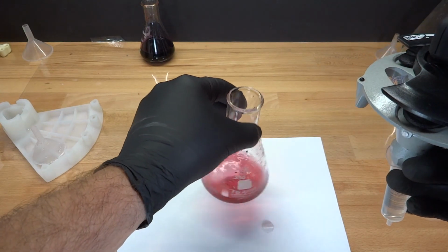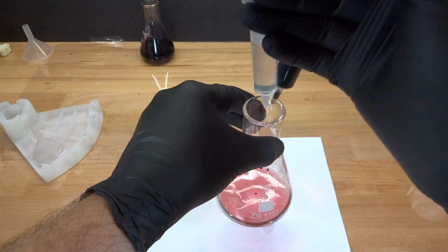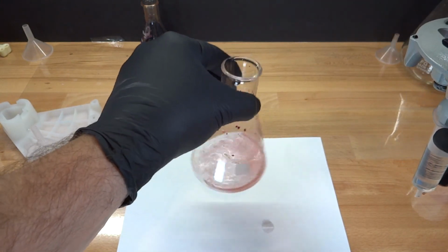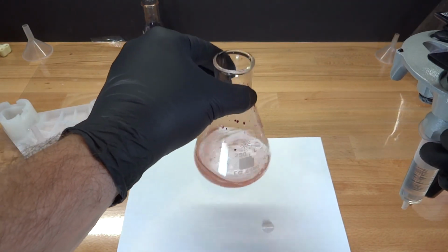Oxygen gas is being produced at a slower pace as evidenced by the froth or bubbles. More agitation of the solution is required and gradual color change can be observed. Finally, a stable, pale pink solution can be observed. This is our stopping point.